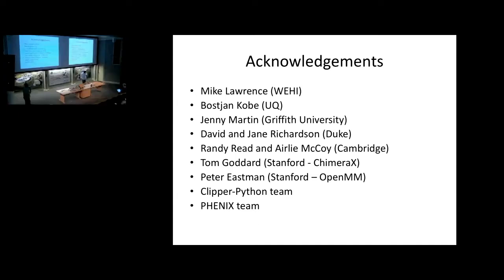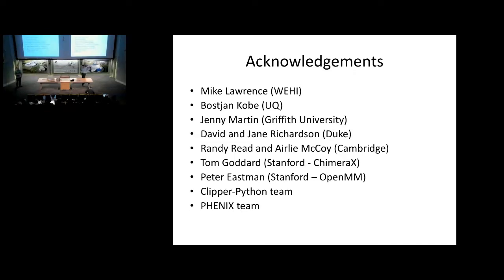Hi, nice talk. Thank you. If I understand correctly, you can't add new amino acids in your program? Not yet. So what's your workflow? How does it go? Let's say you have this for, whatever, 250. Okay, so that one, at that stage, yes, that was quite clunky, you might say.